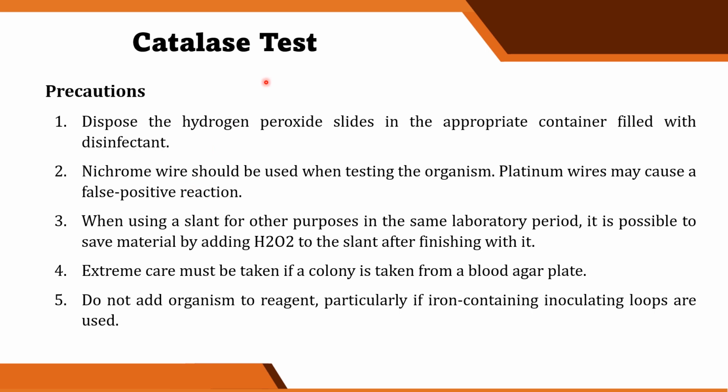Okay. So, what are the precautions naman na kailangan nating tandaan? Okay? So, dispose the hydrogen peroxide slides in the appropriate container filled with disinfectant. For slides used in bacteriology section, sa sharps din natin siya nilalagay. And then, yung sharps container nyo, merong disinfectant. Kunyari, may bleach solution sa loob. Para paglagay nyo doon ng slide, madi-disinfect na siya. Yan. And then, nichrome wire should be used when testing the organism. So, platinum wires may cause a false positive reaction.